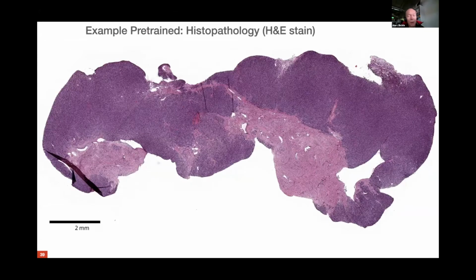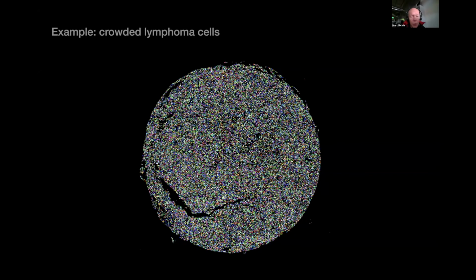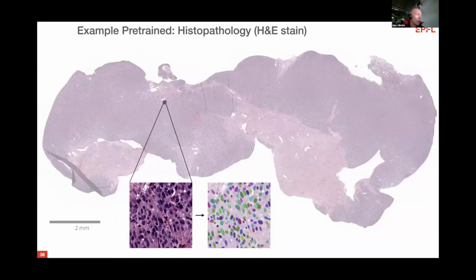Yes, Martin. Sorry, again coming back to the annotation. Sure. So in general, when you're doing a classification or something like that, you try to have as many test cases in your different classes, so that you don't overrepresent one class over the other. Here, for instance, when you were training on these nuclei, you have some which are out of focus.